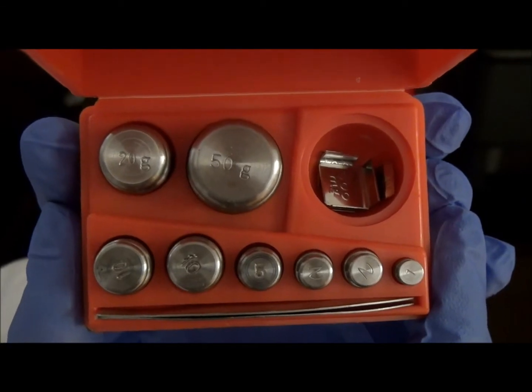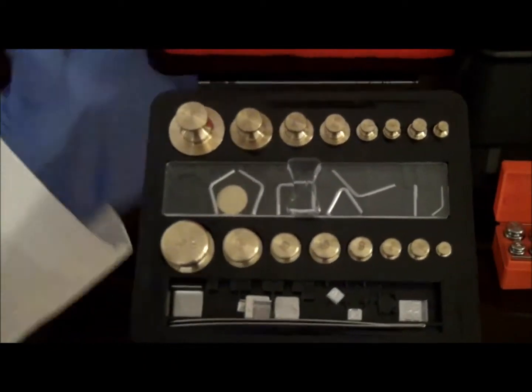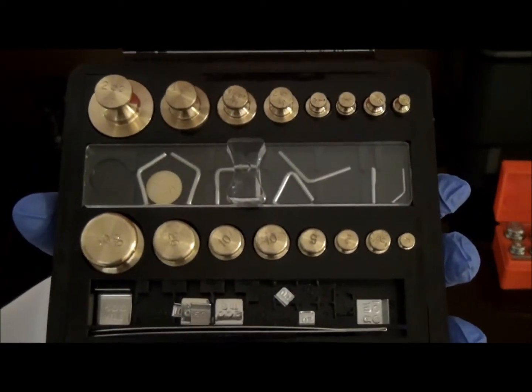Throughout pharmacy school, you will be using this specific metric weight set. However, for completion purposes, we will be using this weight set which contains both apothecary and metric weight systems.